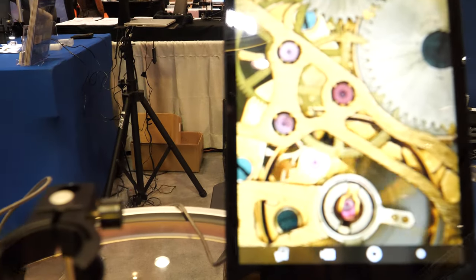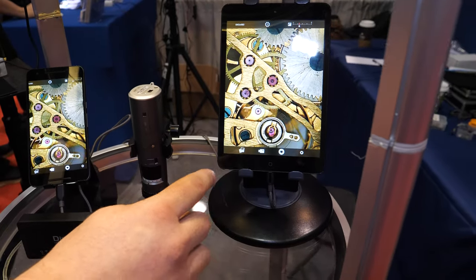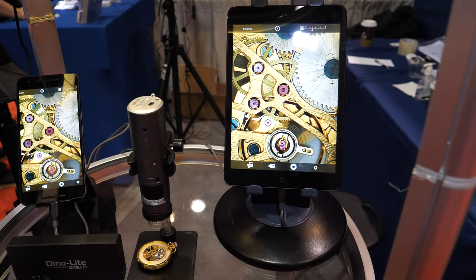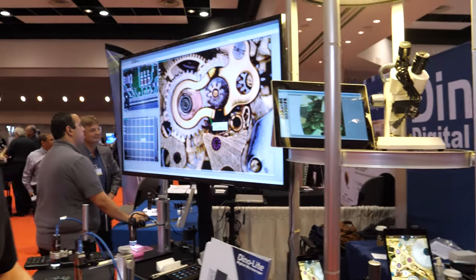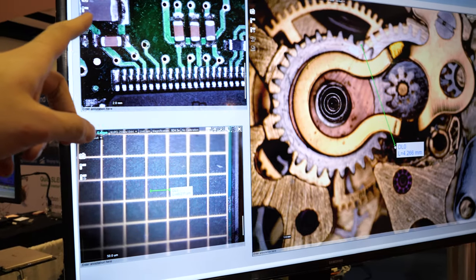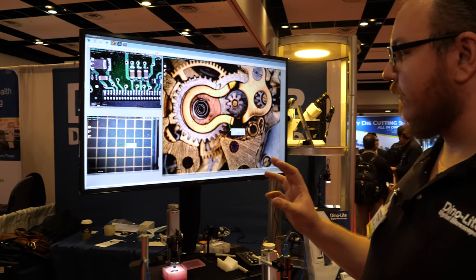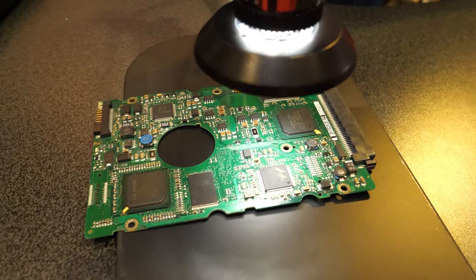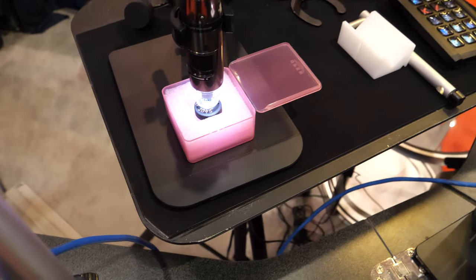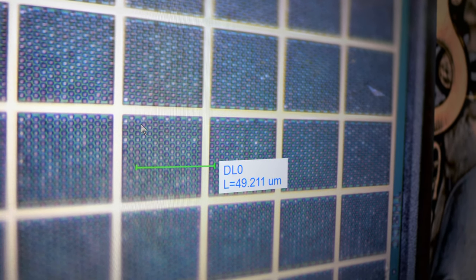These are videos showing how it looks when you're using our wireless scopes and how the apps look. The app allows you to take photos and videos, and you can even do some simple measurements inside the app — it's a scaled-down version of our main DinoCapture software. Here's some PCB stuff, and this is a type of sensor used for detecting methane — it's instrumental in fighting global warming. It's a demo object provided by our neighbors. Each one of these little holes on here are two microns in diameter, and each one of those boxes is 49 microns in width.